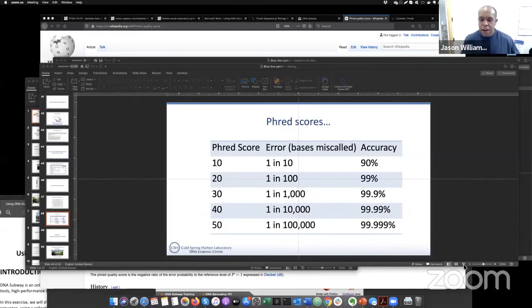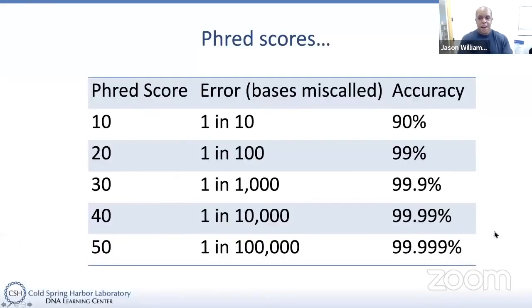When I bring up this chart, if you were following along on Wikipedia, I've made it a little bit bigger here. If you have something that's 99%, well, now that is really, really good. But if you think about DNA, and that many organisms have millions of DNA nucleotides, and in the case of humans, we have billions of nucleotides, you want something that's even better oftentimes than 99% accuracy. So you want to get out in the range of 99.9 or 99.99.